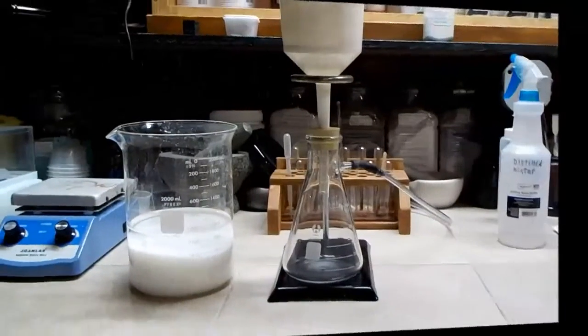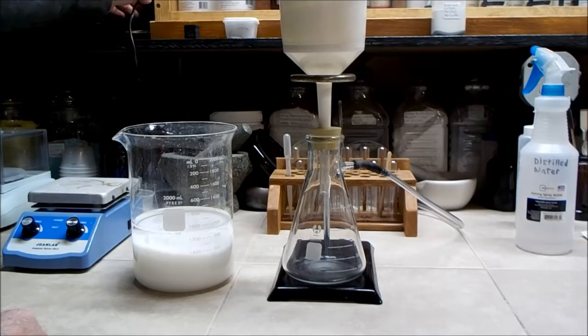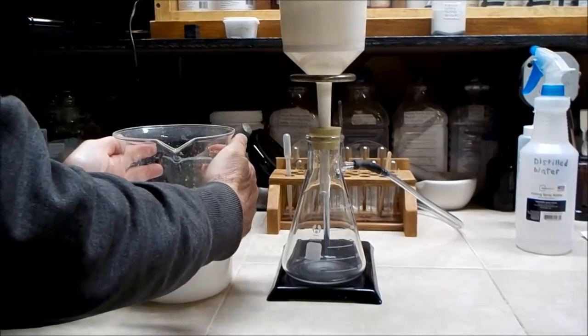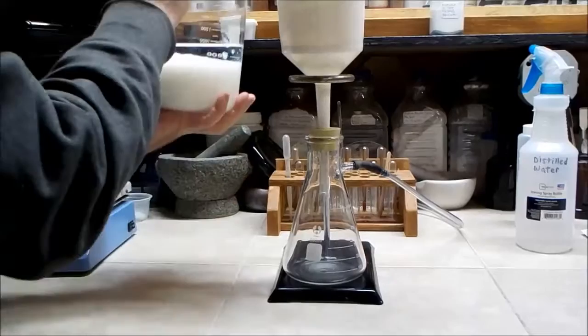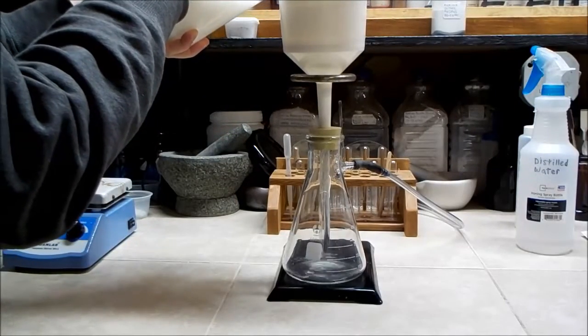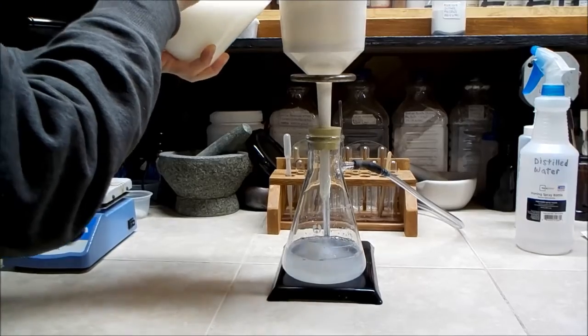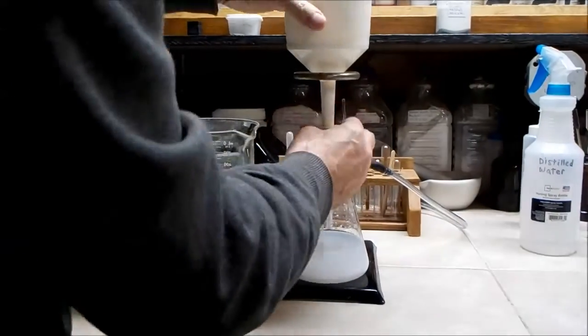Later the reaction seems to have finished and no more CO2 bubbles are being produced. After the solution has cooled and the precipitate has settled, I set up for vacuum filtration through a coffee filter. It looks like some of the aluminum hydroxide is getting through the filter, so I stop and transfer the filter to a beaker.